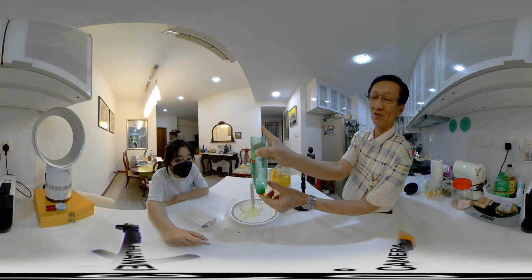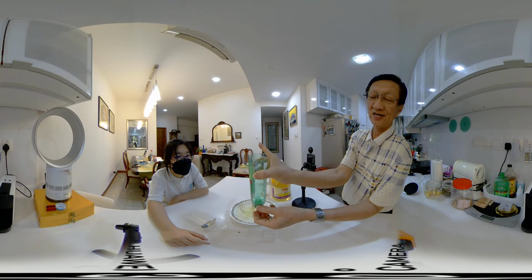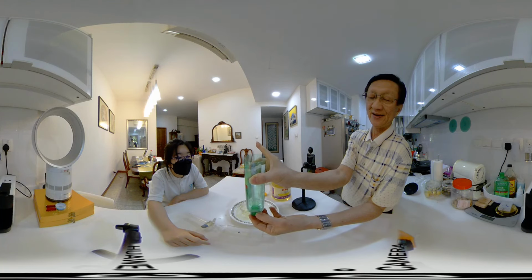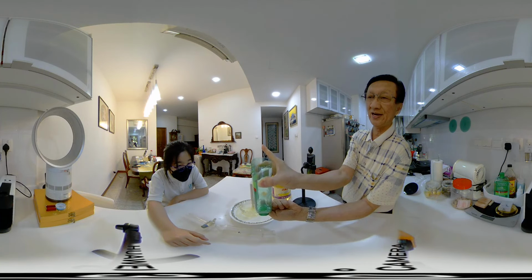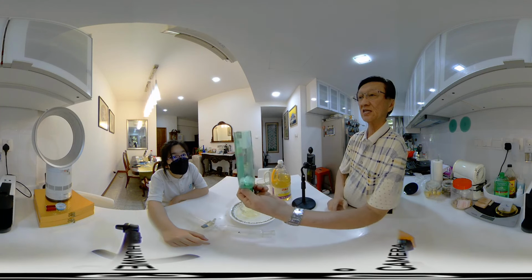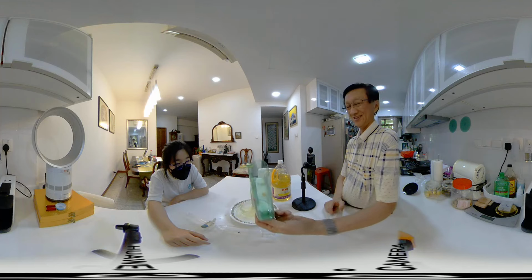And when about all the water is going to be drained away, you close this. Again you waste a little bit, and then the rest of the oil can then be drained into another container. And this doesn't cost a cent. This is very, very cheap. Okay?